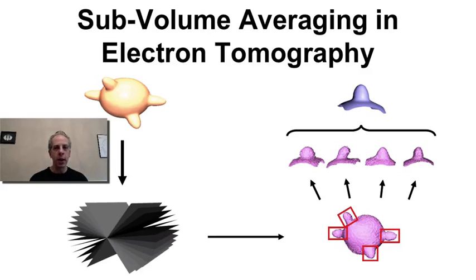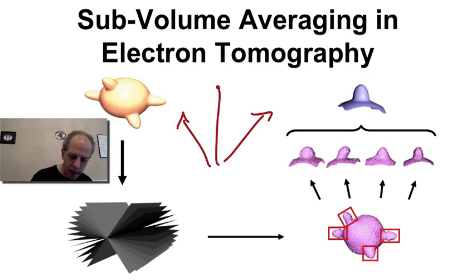but what's the challenge here? Multiple challenges. These images are very noisy. The spikes, the envelopes here, are rotated. We have to align them before we average them. Otherwise, it will be a mess, okay? If you average this with this, let's say these two vectors, you get something like this. Nothing to do with any of them.